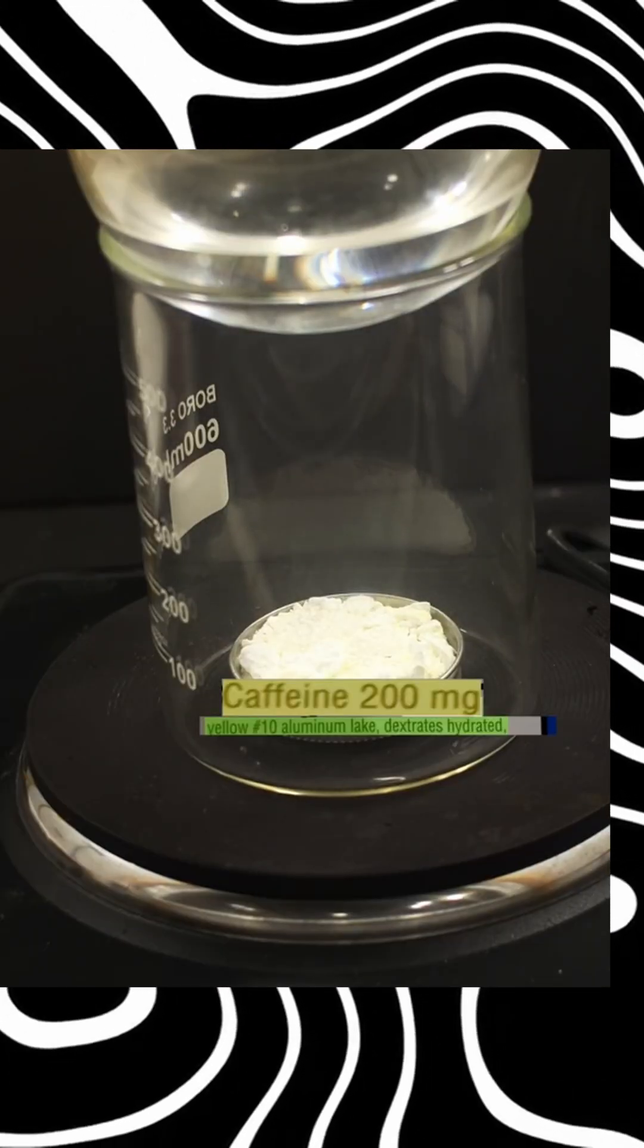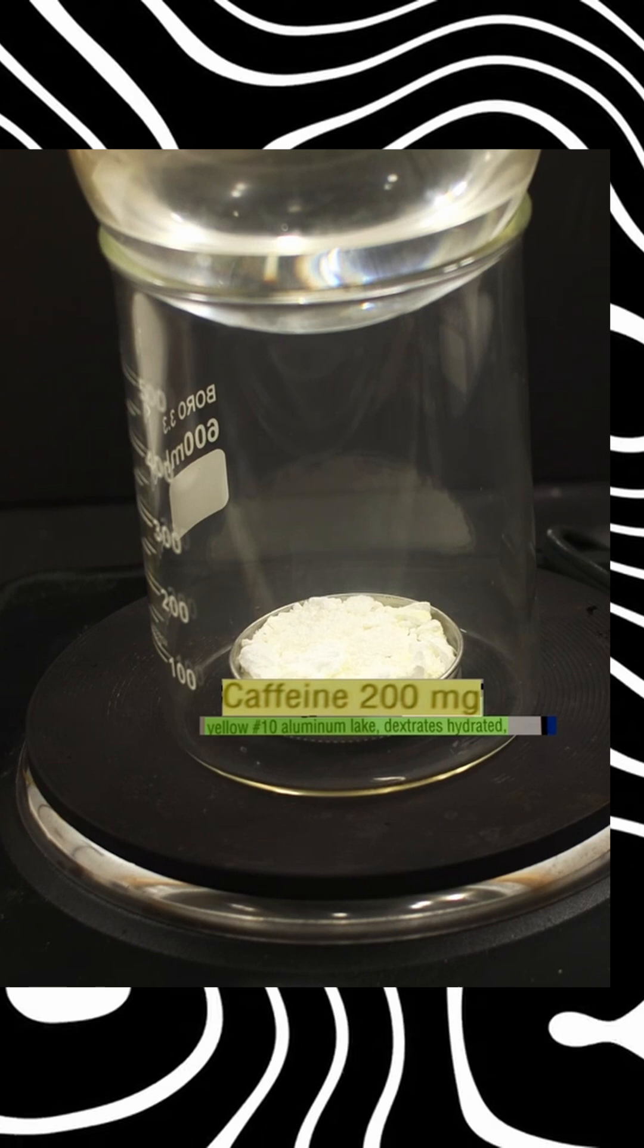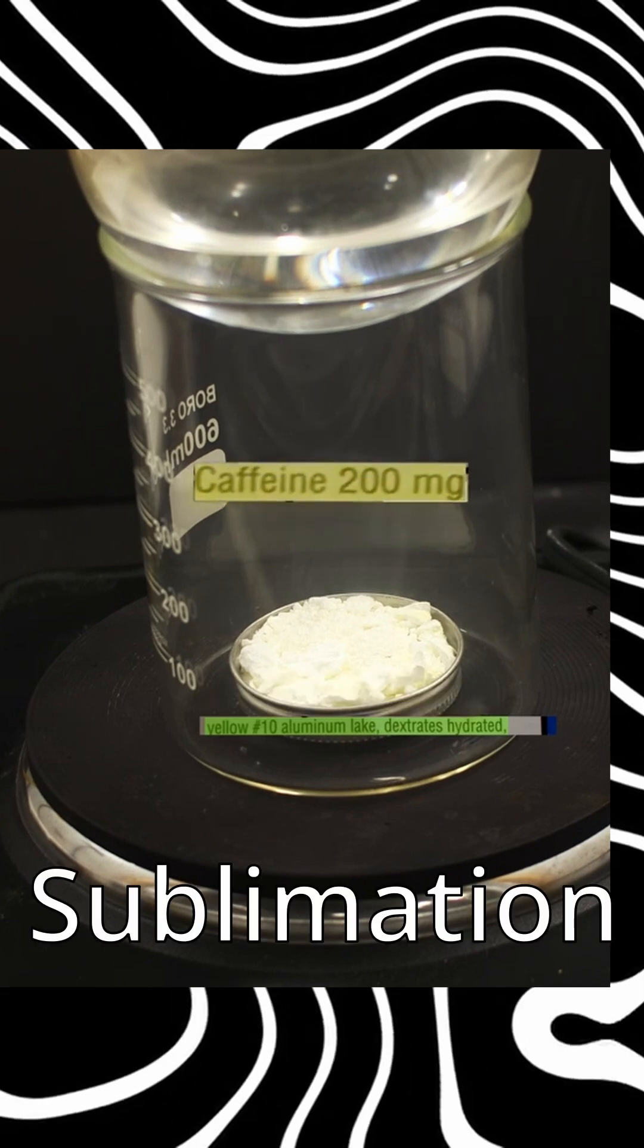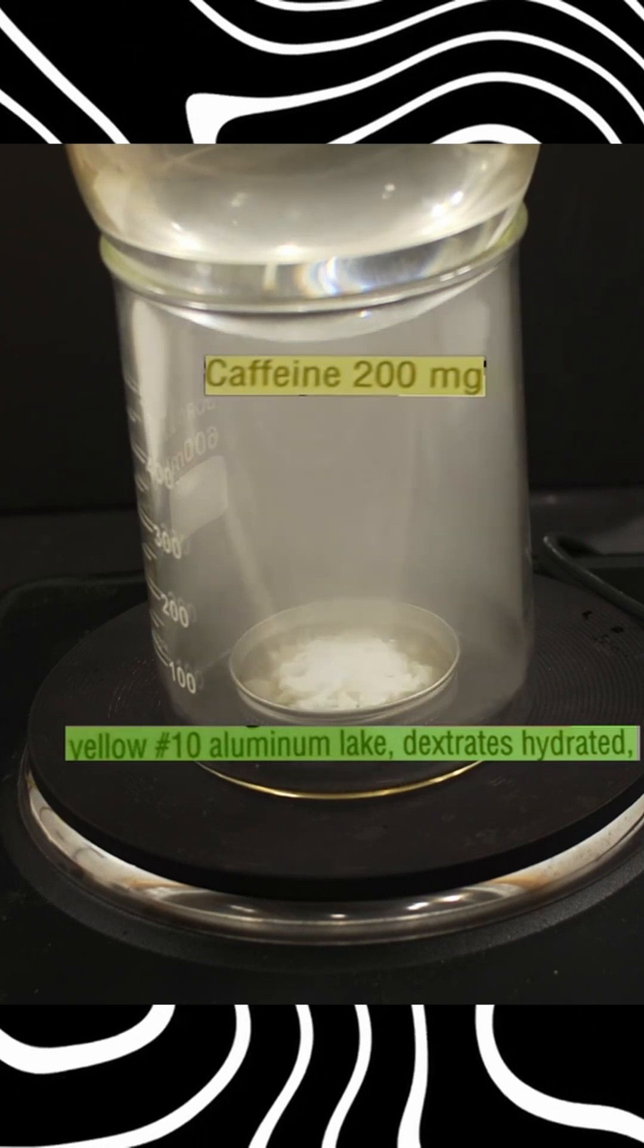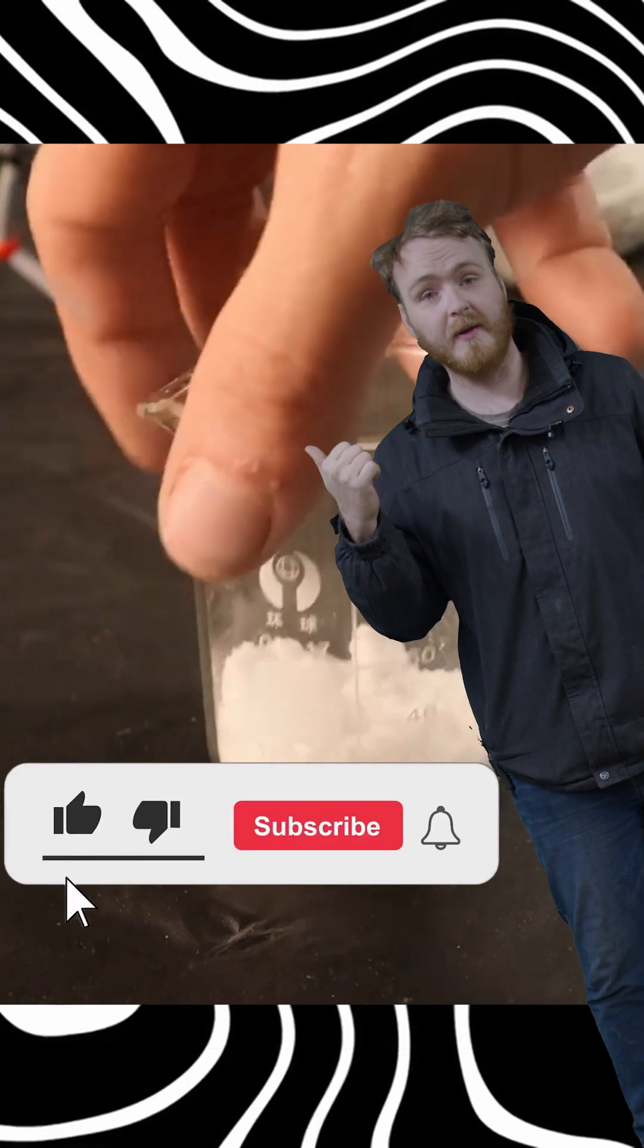And finally, we heat up the caffeine inside a closed container and it undergoes a process called sublimation. It turns into a gas and then that gas collects as a solid on the sides of the container. And there we go, pure caffeine from pills.